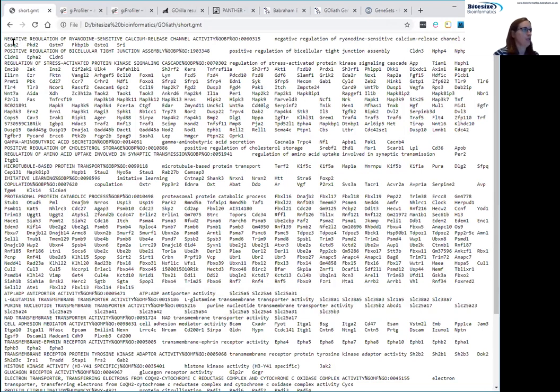containing functional categories. So what we have in here is a name of a functional category, and then we'll have the source that it's taken from. So this is a GO biological process, gene ontology biological process. We've got its name again. And then we have the genes that are or have been annotated as being linked to this category. So in this case, there's only 6 genes in here.